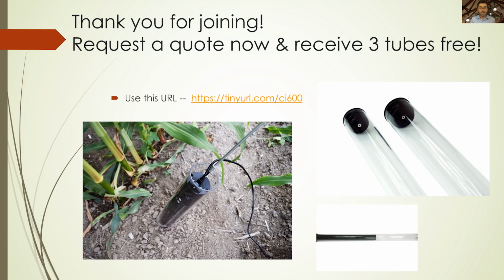The next question: it'd be nice to know if any development has been done in the software to get the statistics of all the roots, including total length, by a single click, as done in destructive root image analysis. So there have been some adjustments. I went over a few of them, to get the full information from the root system, but we are more than happy to add more. As I might have mentioned previously, our software engineers are currently developing another update for the RootSnap software, and we are definitely happy to entertain any ideas as that software is being developed. It's very important for us that it works as easily for you as we can get it, and once that's done, we will send that out to you for free.